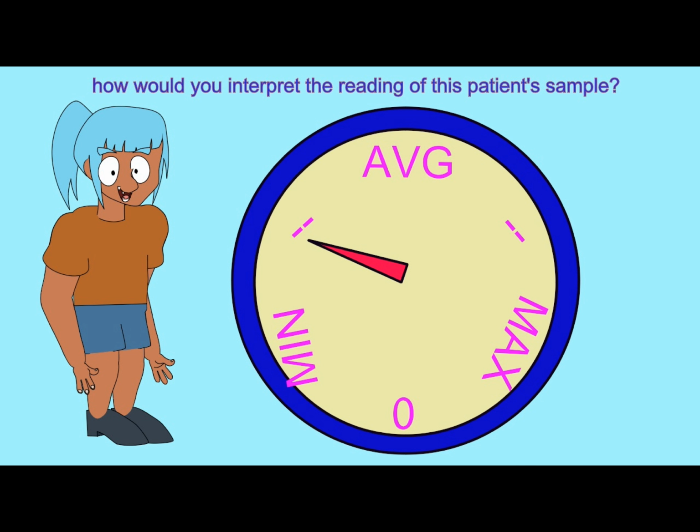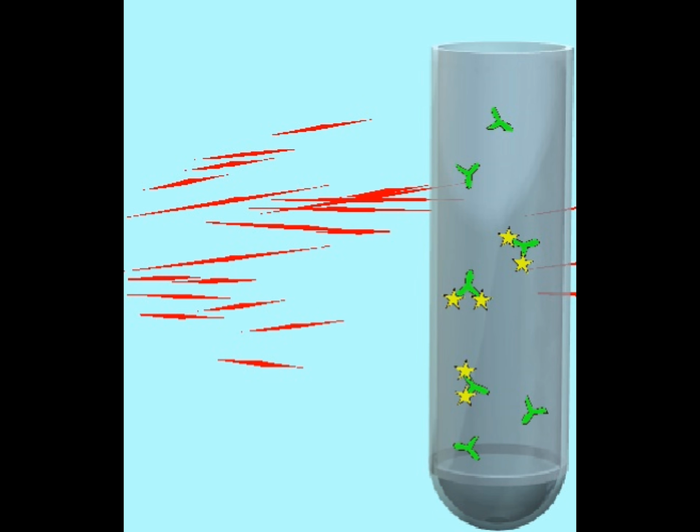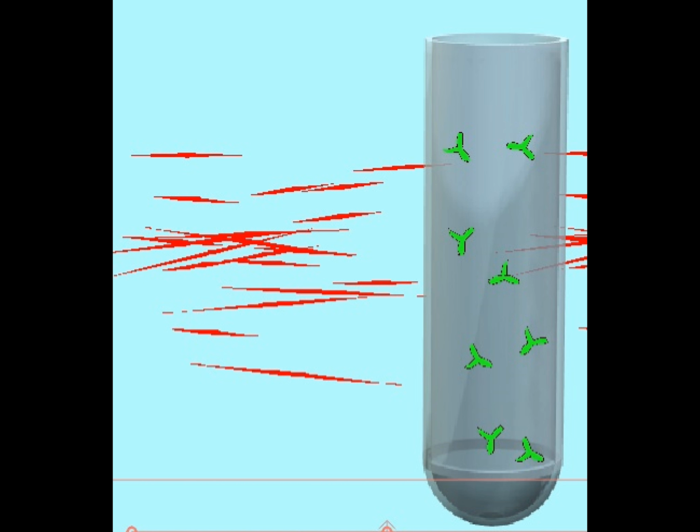So this assay would not only allow the detection of a specific, in this example, serum protein when it is present, but then also a measure of the amount of this serum protein so that one could quantify it and compare it to standard values.